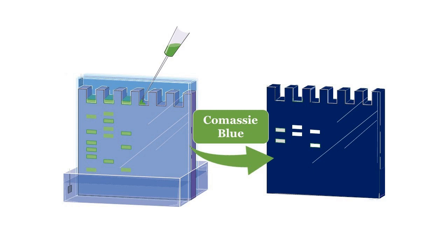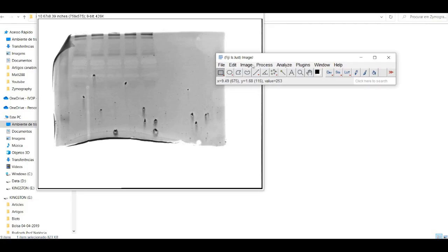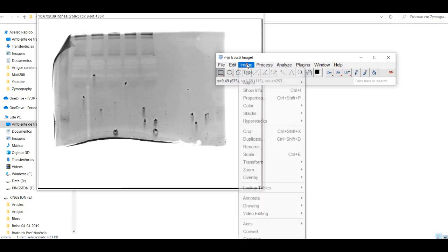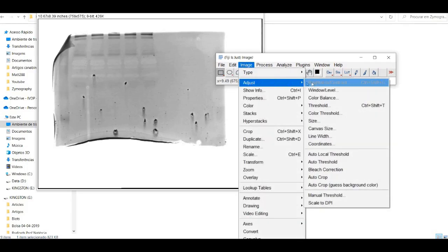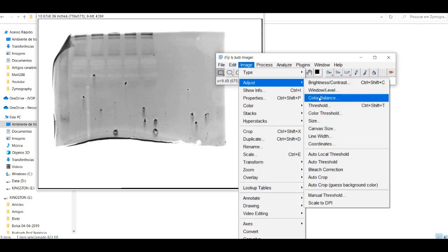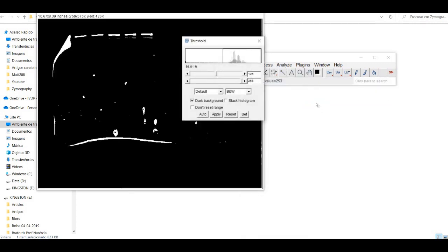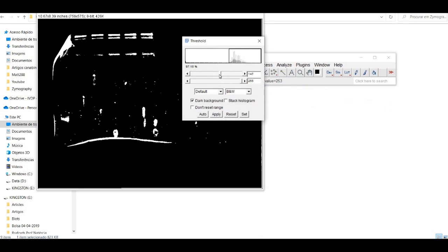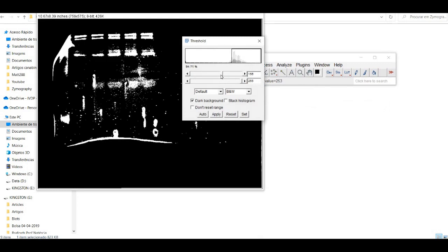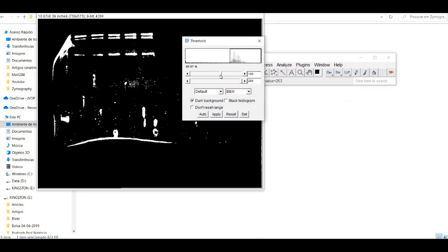To begin analyzing your zymography gel, you'll need to open the image file in ImageJ. Simply click on File and then Open. Navigate to the location where you've saved your gel image, select it, and click Open.